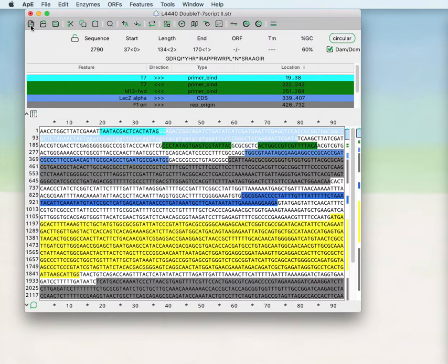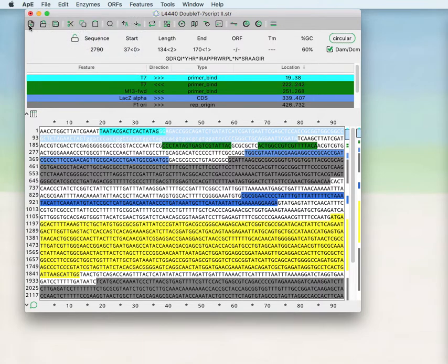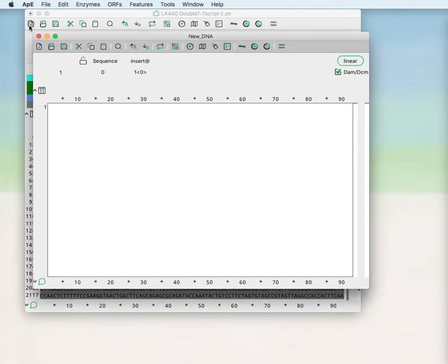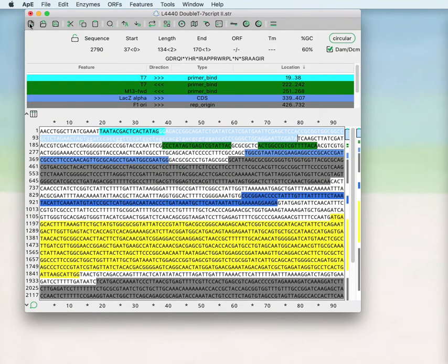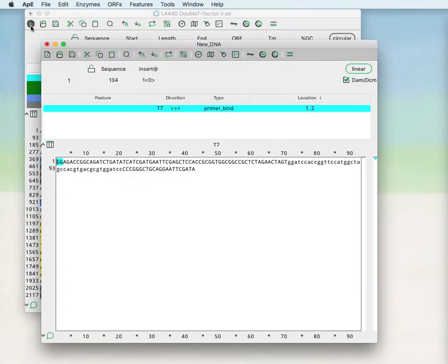You can use the toolbar to perform several functions that are also in the main menu. For example, this button makes a new DNA window. If you shift click on the toolbar and hold the shift key down while clicking, it will duplicate the current selection into a new sequence window.